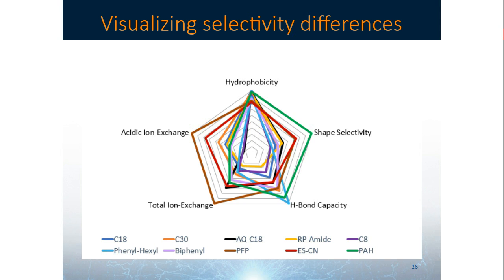Any comment on acidifying mobile phase with formic acid relative to column type and performance? Oh, sure. It really depends. If you have, say, a base deactivated phase, then formic acid will give you fairly good peak shape under those conditions. But if the column has free silanols and you're trying to use formic acid, then you're probably not going to see very good peak shape of your analytes.